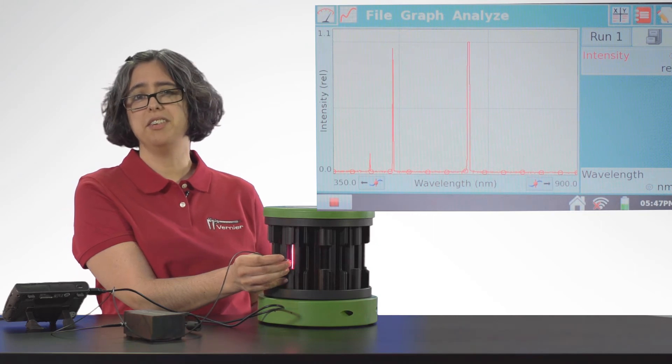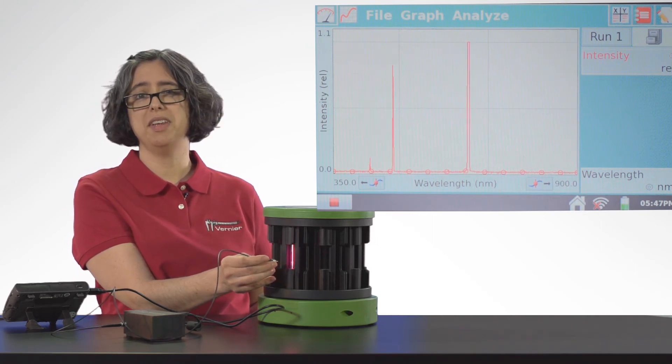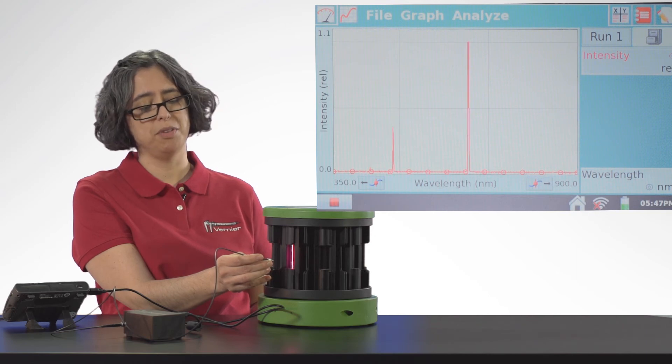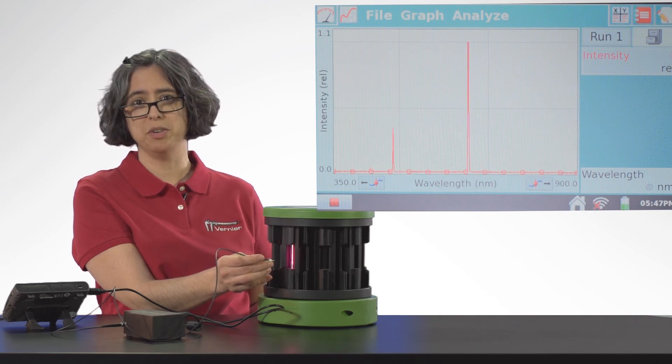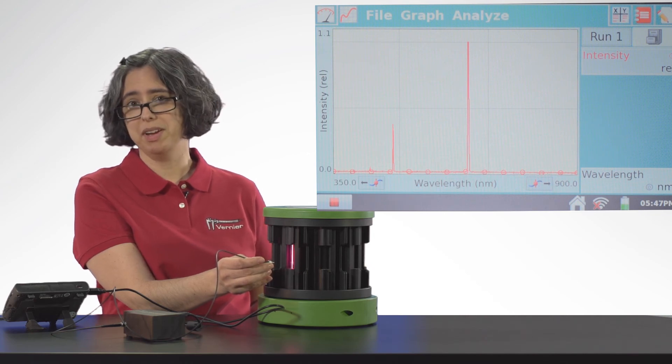In the case of hydrogen, the longer wavelength Balmer line emissions are the most intense. I have to move the fiber away from the source to get a good measurement to avoid saturating the sensor, allowing precise measurement of the wavelengths.